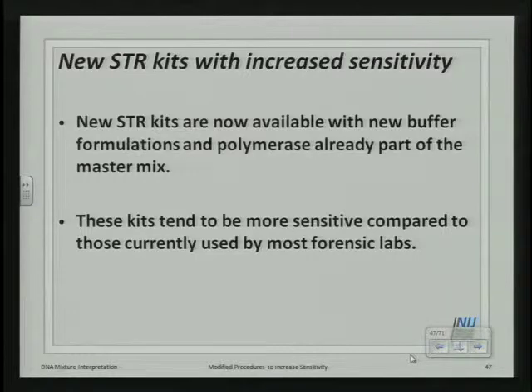So you have to be aware of this, and you also have to do your proper validation studies to know your limits. These kits tend to be way more sensitive compared to those that are currently used by most forensic labs, and the kits can also contain an extra cycle or two as part of their standard method.